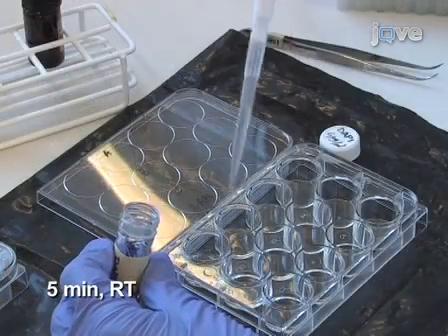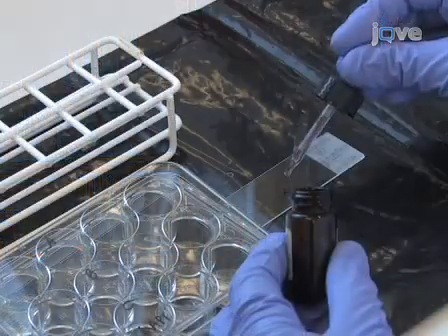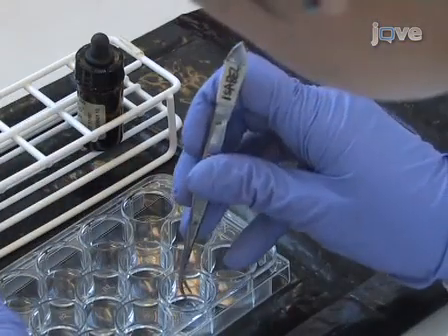Then, counter-stain DNA with DAPI for 5 minutes at room temperature in the dark. At the end of this incubation, wash the cover slips in PBS once and then mount with a drop of mounting medium.